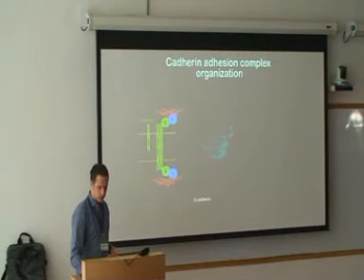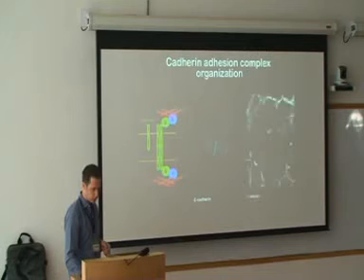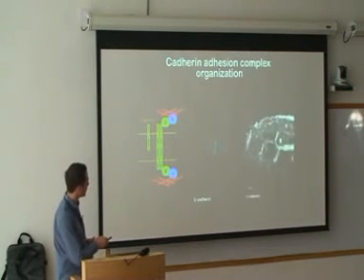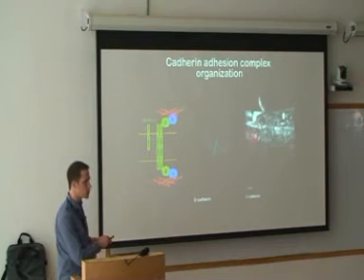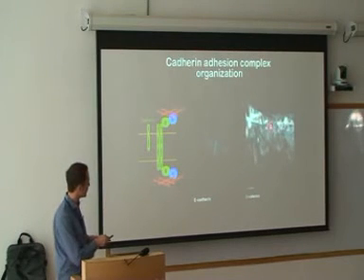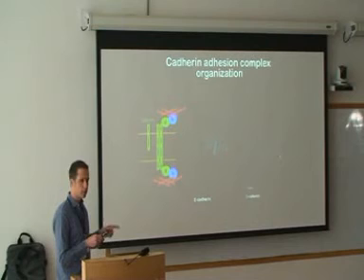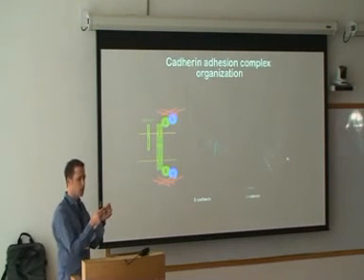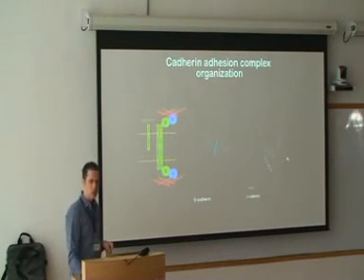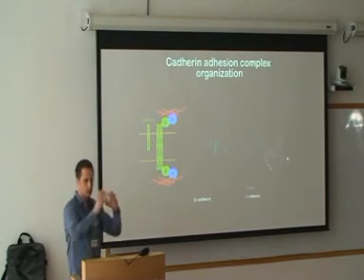Okay, first we looked at the localization of these components just to make sure that everything is in place. And what we find is that cadherins are indeed present. This is an antibody staining, and here we're looking right in the embryo. What is interesting is that these cadherins are not just homogeneously distributed over the cell-cell contact, but they're localizing in a ring-like structure at the margin of the cell-cell contact area. This is where you would imagine the cadherins are required, because there they have to couple the contractile cortices pulling on the cell-cell contact area.